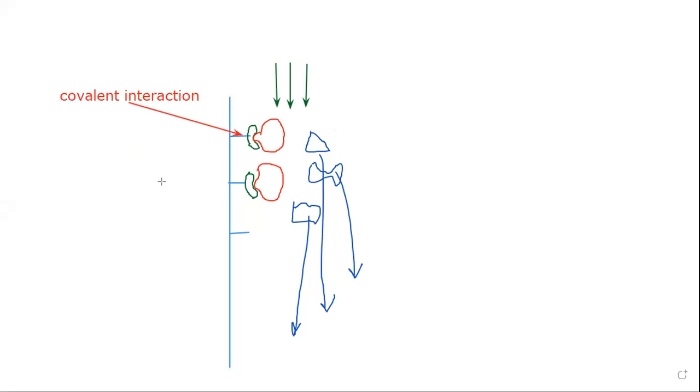Okay, so now what I'm going to do is I will have this same molecule, that is the ligand, which was attached to the stationary phase or the support material. Okay, but that is in a free state. Let me draw it here. Free state. Can you all see that?